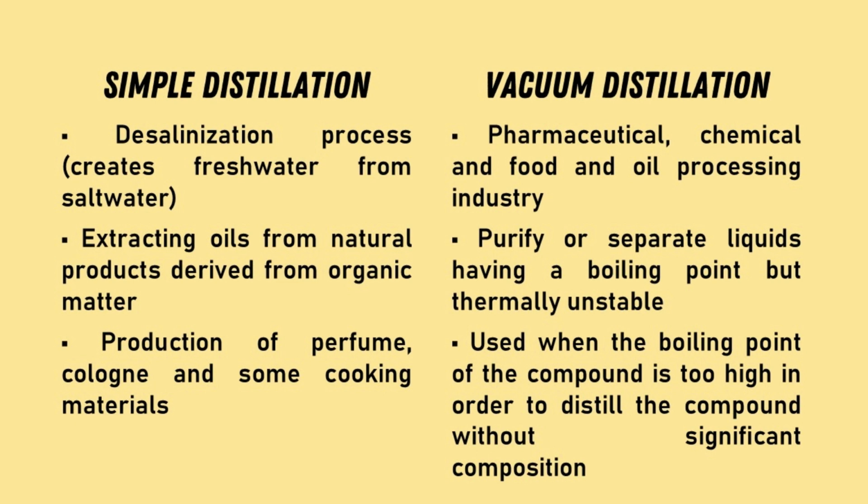While vacuum distillation is a method in which compounds will boil at lower temperature when pressure is reduced. Hence, it is useful to separate components at lower temperature but difficult to maintain lower pressure. It is used in the pharmaceutical industry, chemical industry, and food and oil processing.